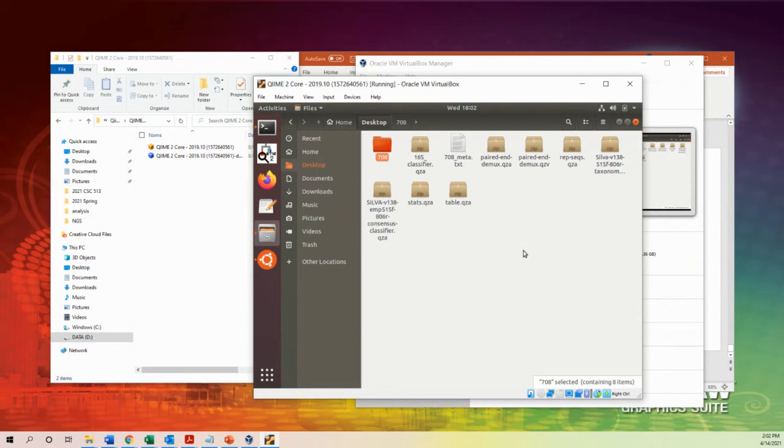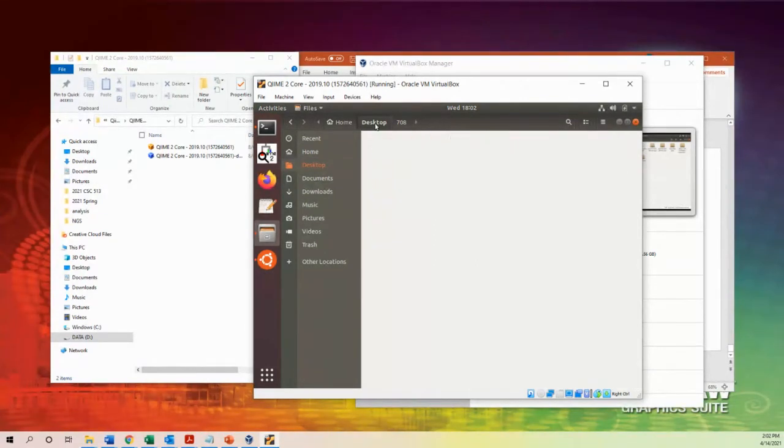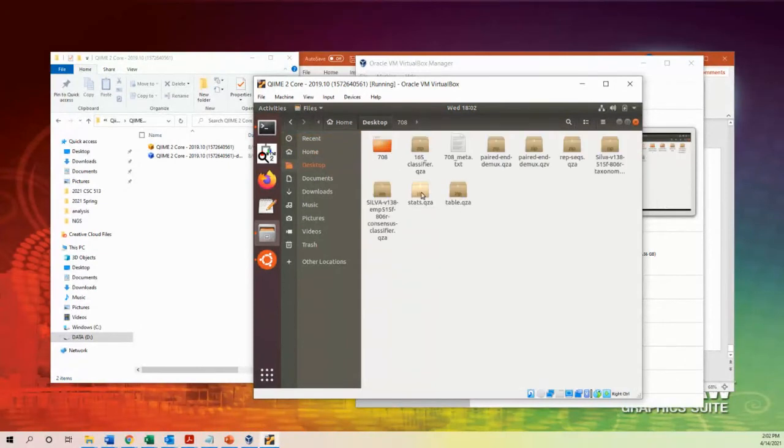Then you go to the Blackboard, and you should see the 708 meta.txt. I want you to drag and drop the file under the desktop. So here's the desktop: from home, you have the desktop. You click desktop, you should see the 708 and nothing else. So you need to drop the 708 underscore meta.txt file into this folder. Once you've done this, then raise your hand, okay?